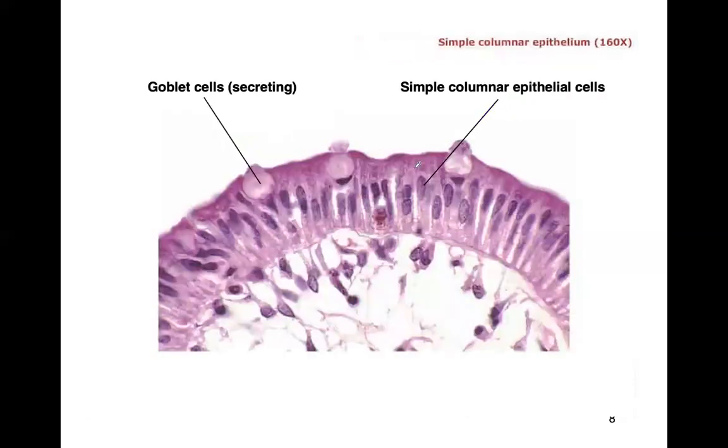Okay, here's another one. It's a larger magnification. We see cells closely packed together. They are epithelium. And these columnar cells are one cell layer thick, so they're not stratified. So it's simple, and they're columnar. Once again, this is a goblet cell, and we can actually see exocytosis happening. It is secreting. It's a goblet cell that's pushing out the secretion that will stick to the cell's surface. Okay, so it's simple columnar epithelium, but if an arrow pointed to this structure, it's a goblet cell.